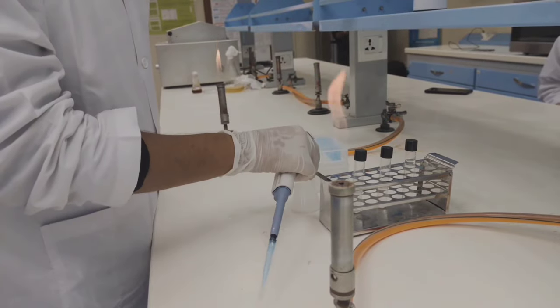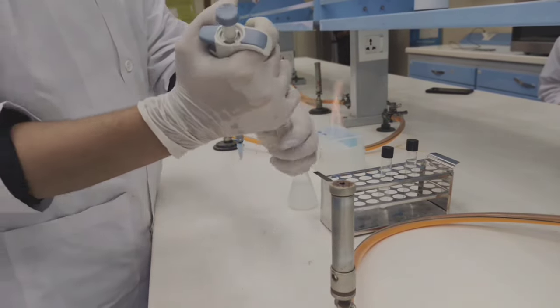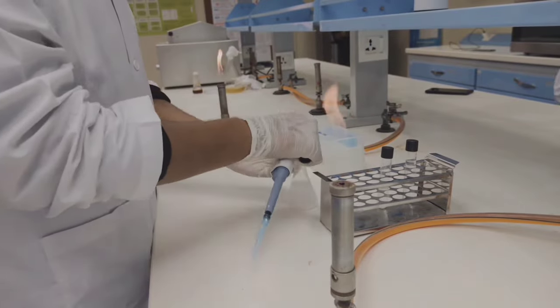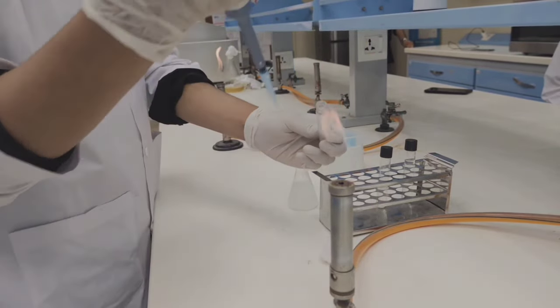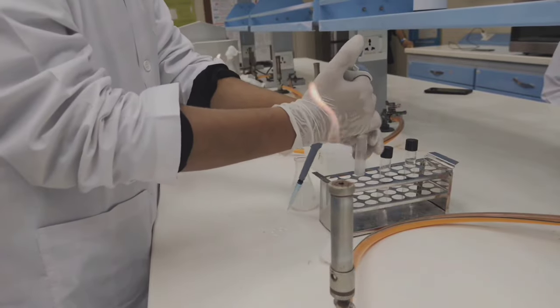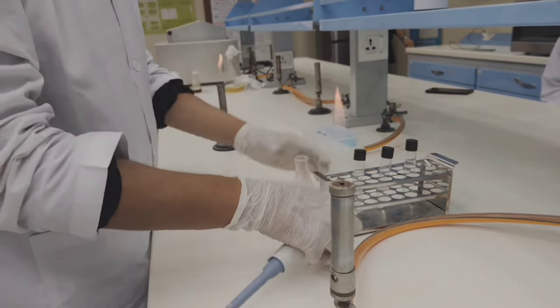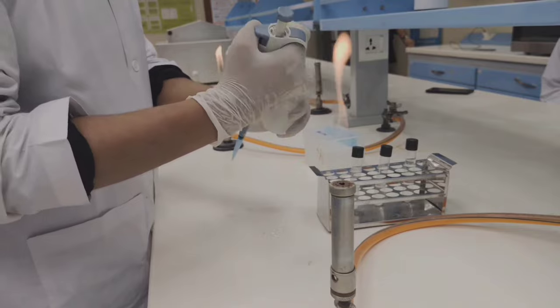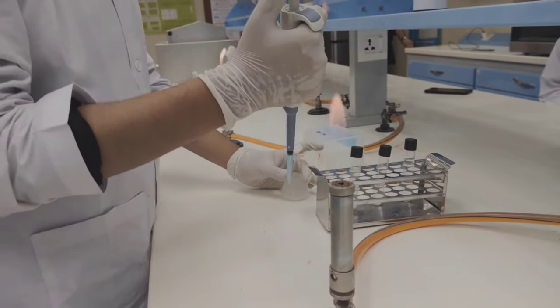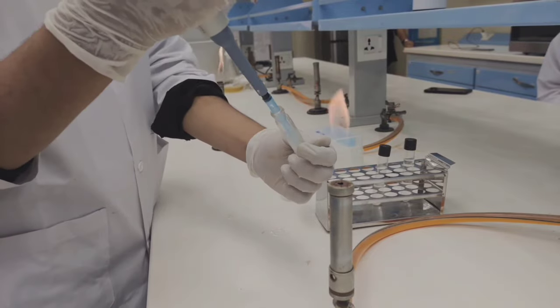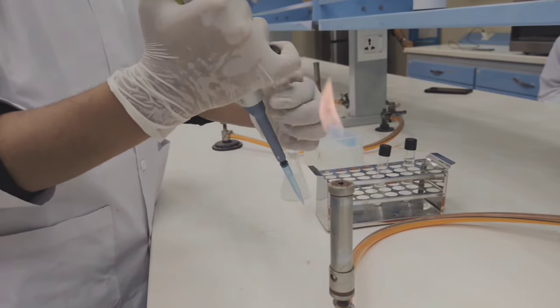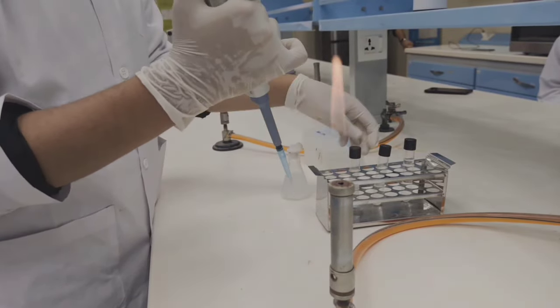Then we have to inoculate sample from that flask, from the diluted flask, to another test tube in which only diluent is present. Then we have to take one ml sample and inoculate in the other test tube. Now we have to shake that test tube to get the solution mixed well and seal all bottles to avoid contamination. Now we have to take one ml of solution from that test tube and then inoculate in a third test tube.